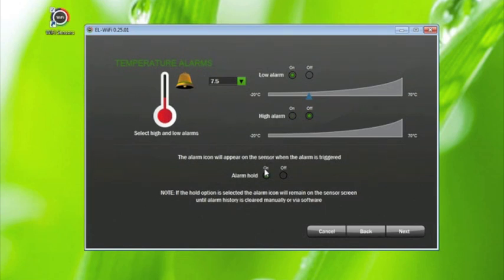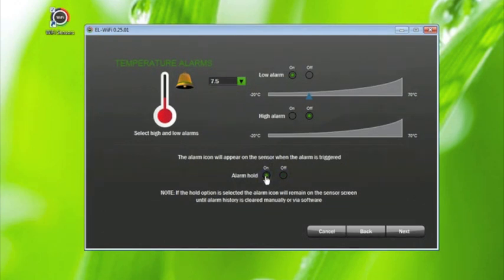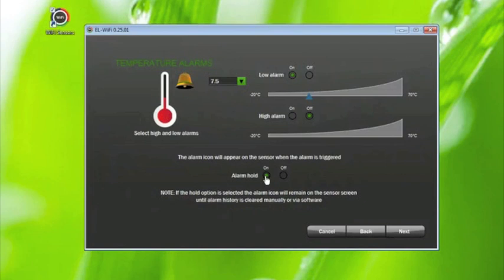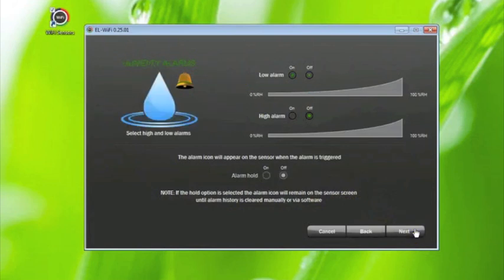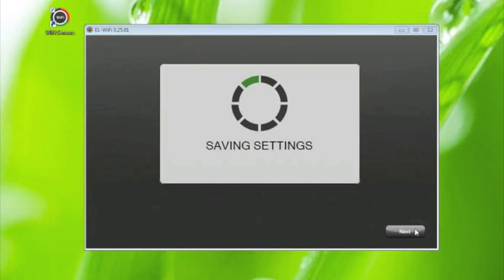The alarm hold feature, if selected, will set the sensor to display the flashing alarm bell symbol on the LCD until alarm history is cleared manually or via software. Click next and repeat the process for the humidity alarms if required. Then click next to save settings. This may take a few moments.